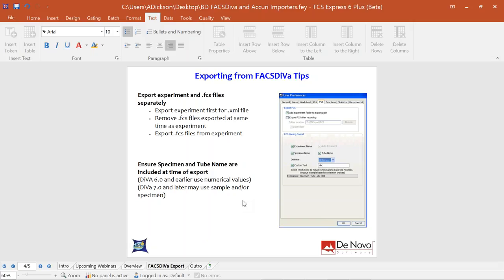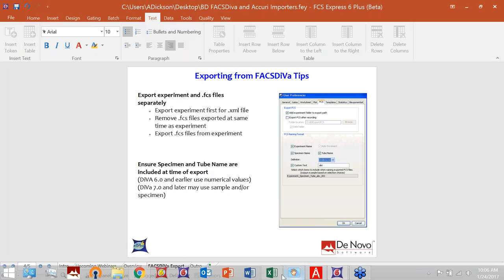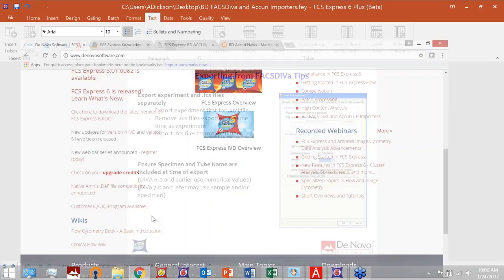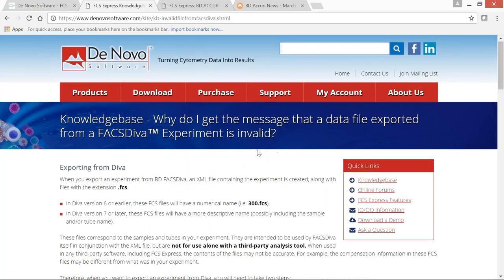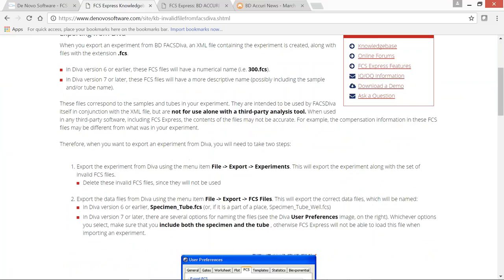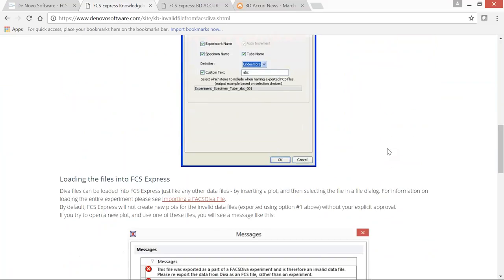The second tip: depending on which version of FACS DIVA you're using, make sure the specimen and tube name keywords are associated with your exported data files. For DIVA 6.0, files may be named something like 1, 2, 3, 4.fcs, while version 7 or later may include the sample or specimen keyword. For detailed instructions, visit our website's knowledge base page.